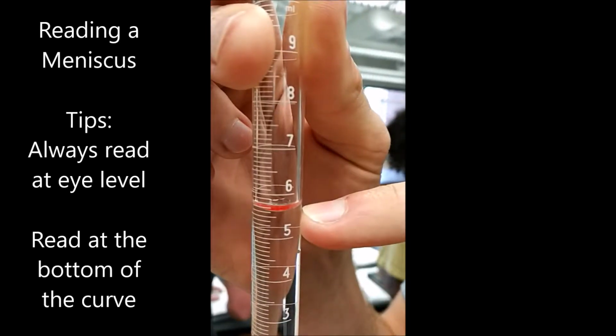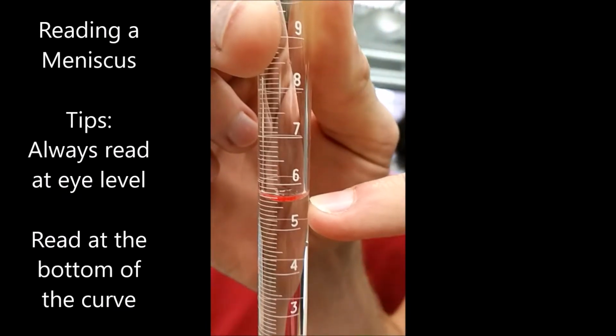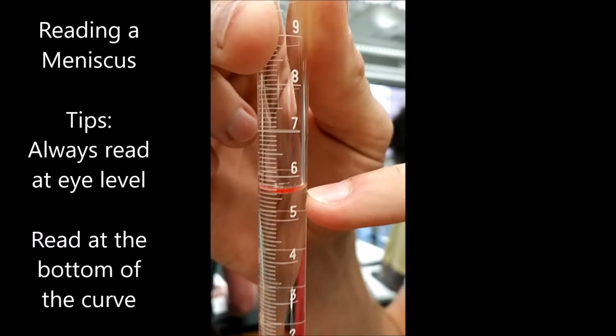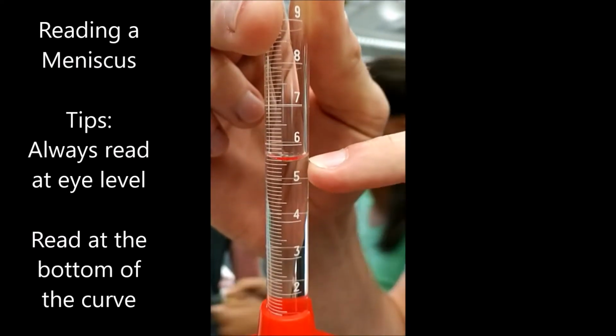Make sure you practice this method while recording initial and final volumes in the pipette, as well as ensuring there is only 10 milliliters of liquid in the volumetric flask. Now that you know this method, you may continue on with the rest of the lab.